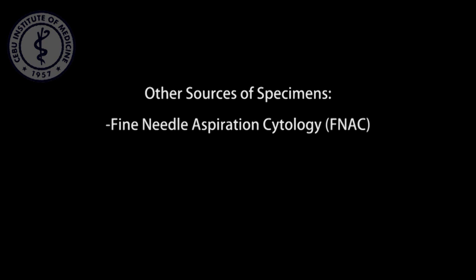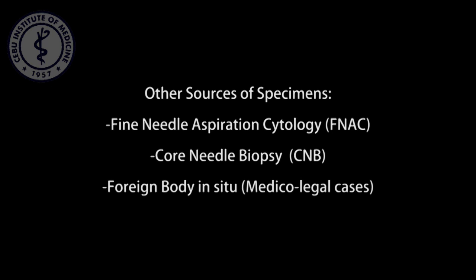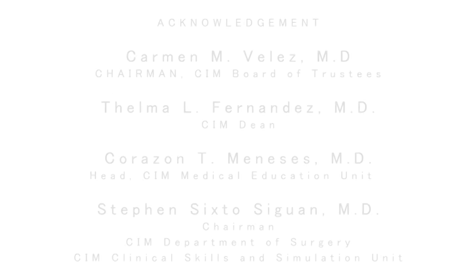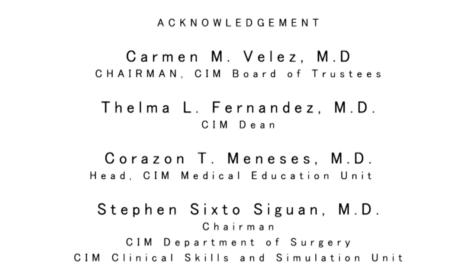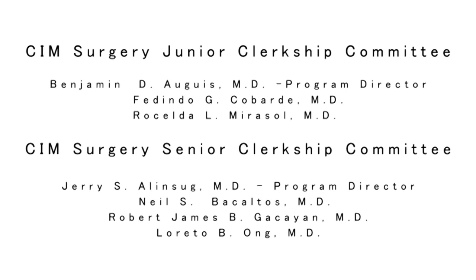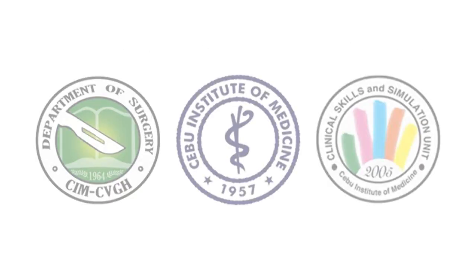Fine needle aspiration cytology, core needle biopsy, foreign body in situ, medico-legal cases.